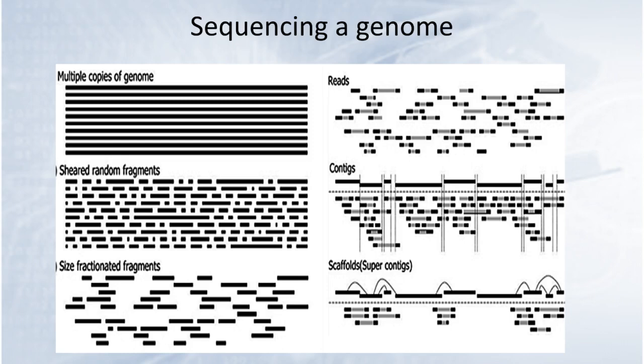So what we end up with, if you look up in the top right sector of this diagram, are fragments depicted by each of the bars, and then sequences from the ends of those fragments. And so we know, for example, that the read going in one direction, or R1 as we'll come to call them when you're doing your analysis, which will be 250 bases, is actually paired to another read that's also 250 base pairs that's coming from the other end of that exact same fragment.